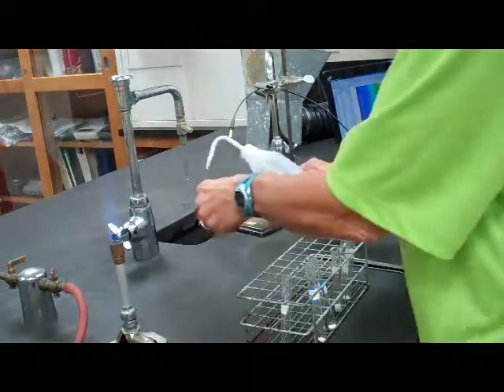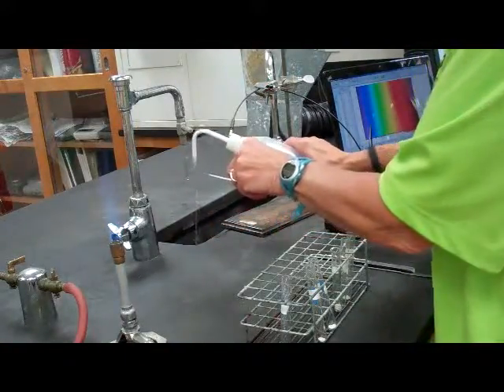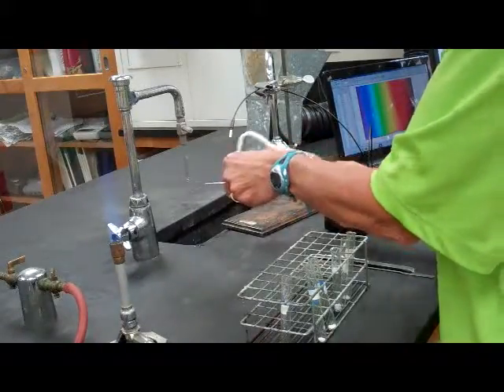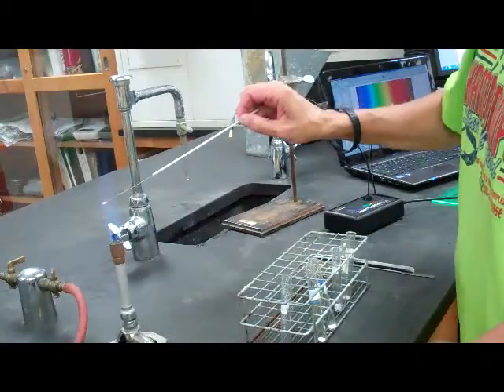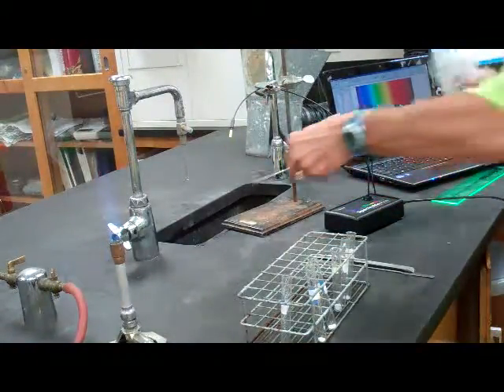I hit stop on the computer, and I am rinsing my loop with distilled water. It says for at least a minute. I wouldn't want contamination between my different samples. So, just to double check, burn off the loop again. Nope, looks like I still have some leftover color on there.